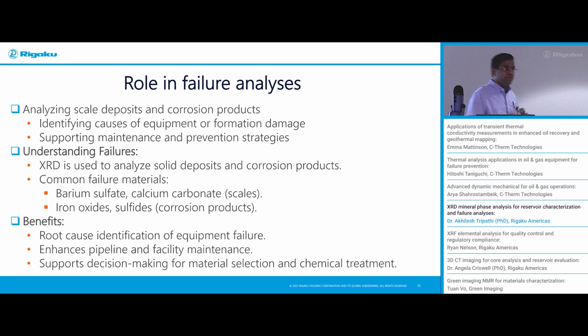So let's switch the topic to the next one. How about role in failure analysis? So what we want to achieve in failure analysis: analyzing scale deposits and corrosion products, identifying causes of equipment or formation damage, supporting maintenance and prevention strategies.